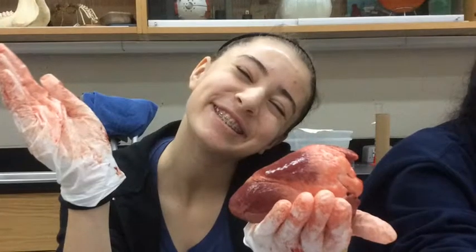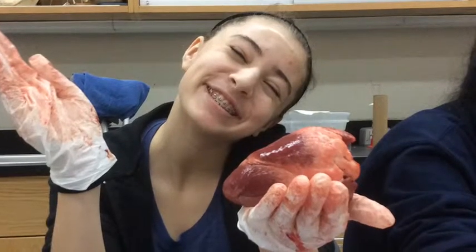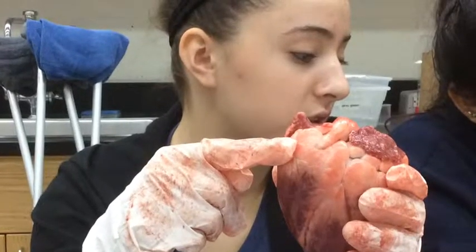The coronary veins drain blood from the muscular tissue of the heart. Coronary arteries supply blood to the heart muscle. There are two blood vessels and they are called arteries and capillaries.